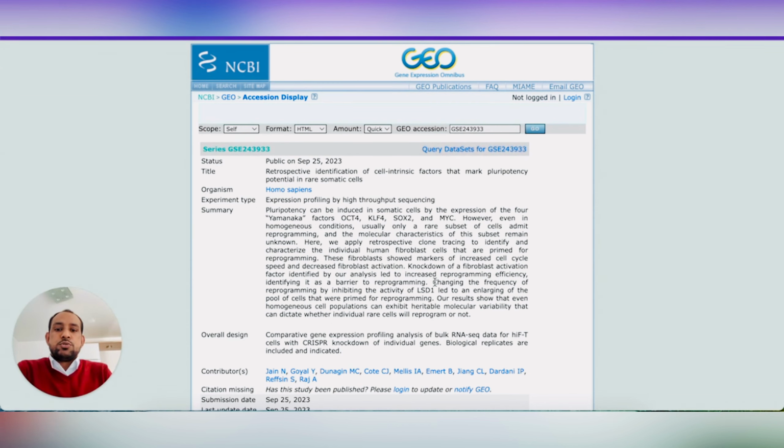So here I want to discuss one thing. When we do sequencing, there are two types: one is paired end, the second is single end. Paired end is when we do the sequencing from both ends. Single end is when we do the sequencing from one end of the nucleotide strand. It is a pretty simple concept, but you will find it whenever you are searching for data.